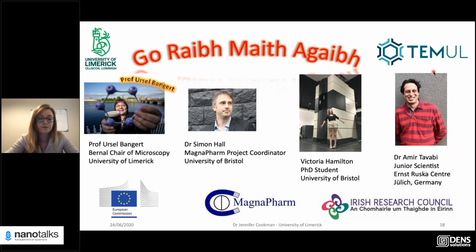Okay, thank you. And I have another question. You said that the tilting can help to diffuse the liquid, but what do you think of that principle? Yeah, I don't know. It seems to work in combination with leaving it for a while and also increasing the flow. So when I have that problem, I sort of hit everything at it. And it was a troubleshooting method also suggested by Dens as well.